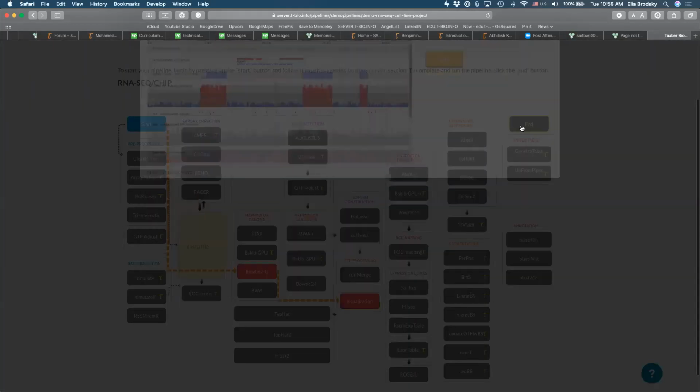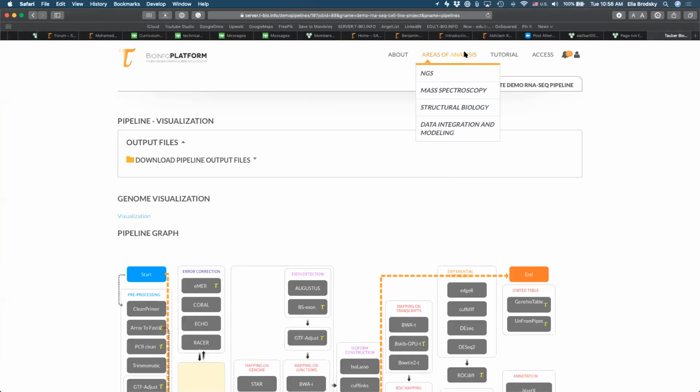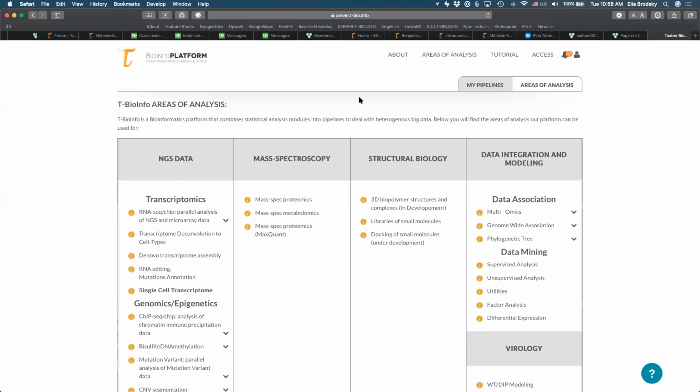And it also allows you to process big data not on your laptop, right? So if you wanted to, for example, take samples directly from patients, and FASTQ files from those patients would be used here on this platform, it might take you minutes, hours, or days, but it's not on your computer. It's accessible through the browser. I know personally I've tried processing FASTQ files on my laptop. First of all, it will take days, and second of all, there's nothing else that you can do on your computer. So it's really an efficient way for you to conduct this type of analysis.